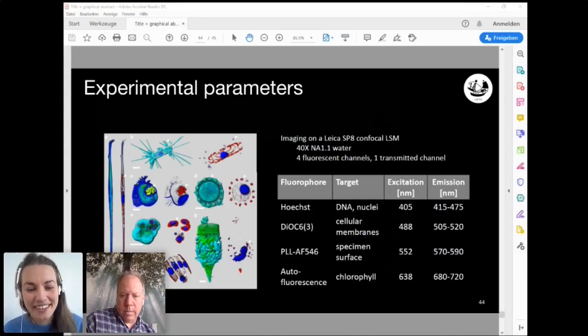There's another question from Miso Mitkovsky. It says, thank you for the talk. Have you considered other imaging methodologies, such as FLIM or CARS? Not yet. Confocal is still... you really want to try and make things as fast as possible, and some of those techniques are going to be generally slower, I'd have thought.